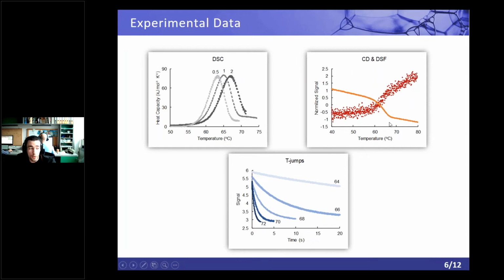And then eventually you have 3 different types of signal, and they might not agree, because the underlying process is the same. It's just protein unfolding, and you expose it to high temperature, so even the setup is the same, just a temperature shock to a protein. But actually, you get 3 different sides of the same process, and then you want a tool to put them all together. And unfortunately, when we started working on this type of data 3 years ago, we realized that there was no such tool.